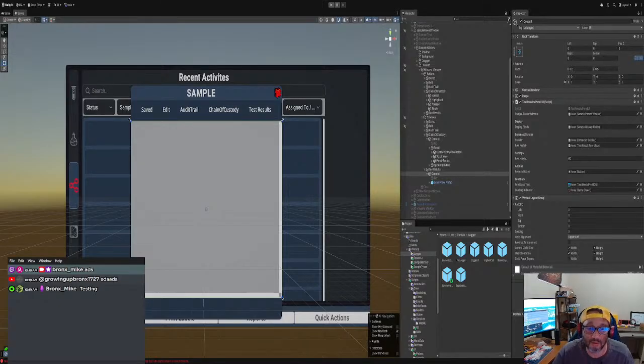So what we're going to do is just for hypothetical. All right, we're going to right click on here and go UI table layout. Remember, I downloaded this plugin so we can make it easier for us to build, right? So we had 6 columns, correct? So I'm going to right click on here, go table layout, and add a table.